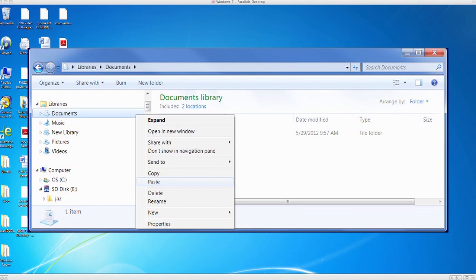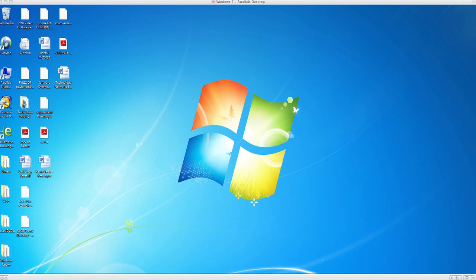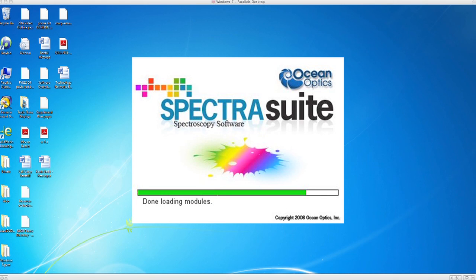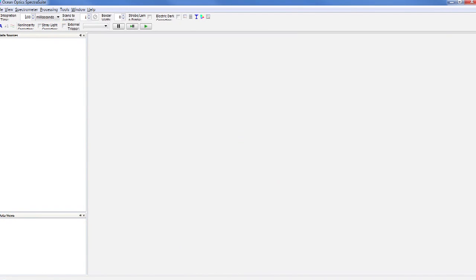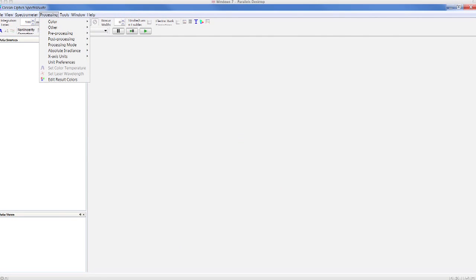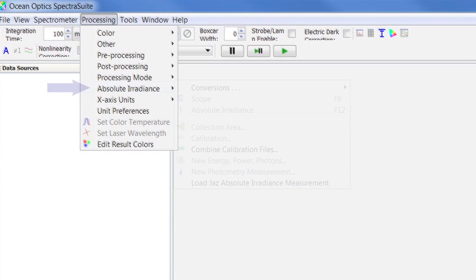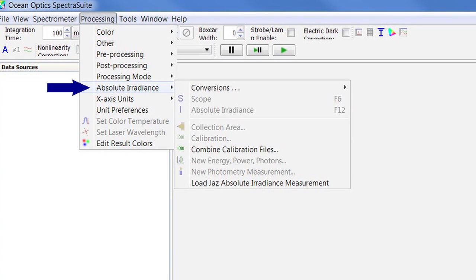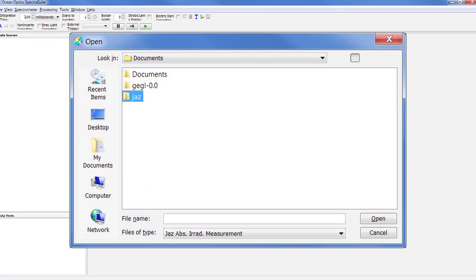we'll demonstrate how to perform post-processing of your data in SpectraSuite for color analysis, radiometric analysis, or photometric analysis. Start by launching SpectraSuite. When SpectraSuite opens, on the top toolbar, go to Processing, Absolute Irradiance, Load JAZZ Absolute Irradiance Measurement. Now locate the folder of the file you wish to open.